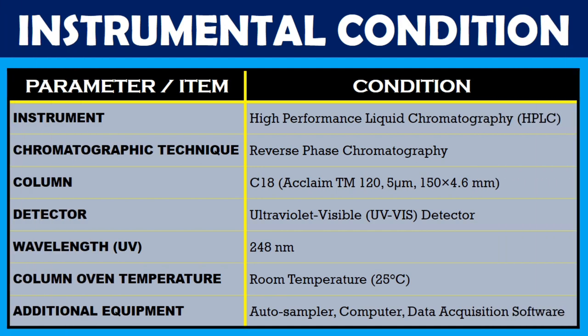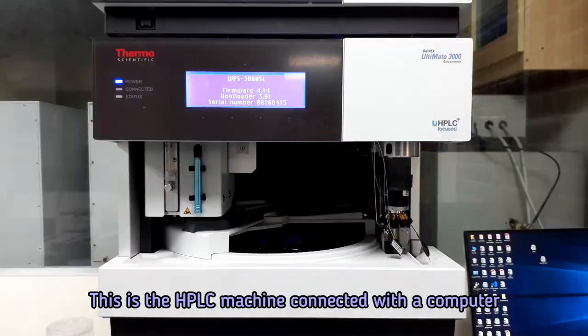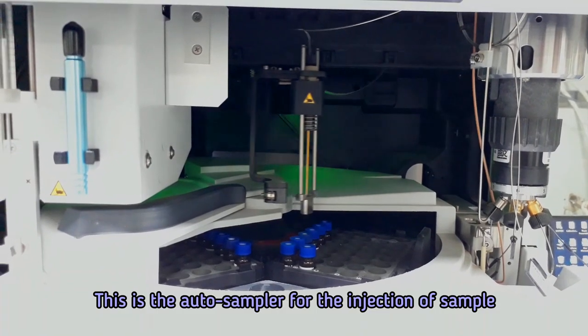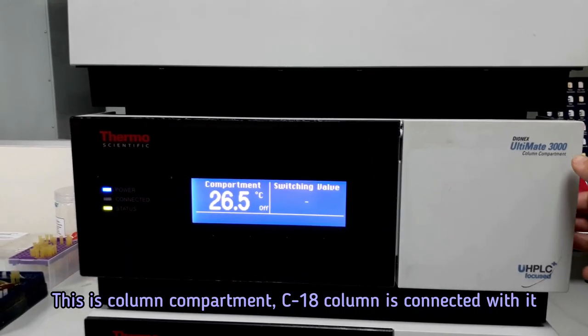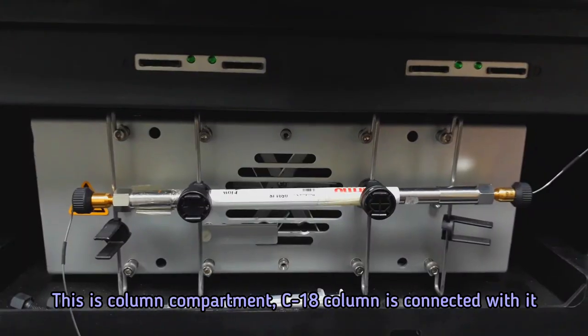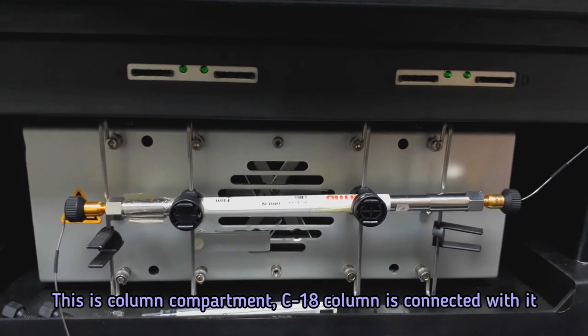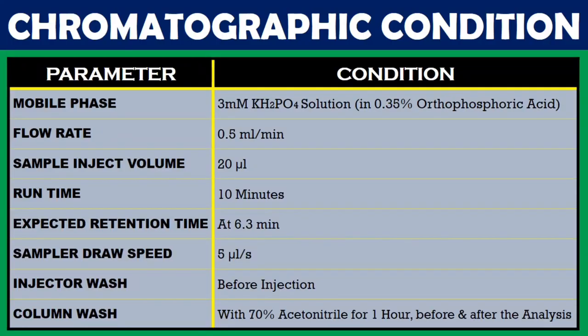Instrumental conditions are shown in the display, so let's set the HPLC system accordingly. This is the HPLC machine connected with the computer. This is auto sampler for the injection of sample. This is the column compartment and the C18 column is connected with it. This is the UV-VIS detector chamber and this is the data acquisition software.